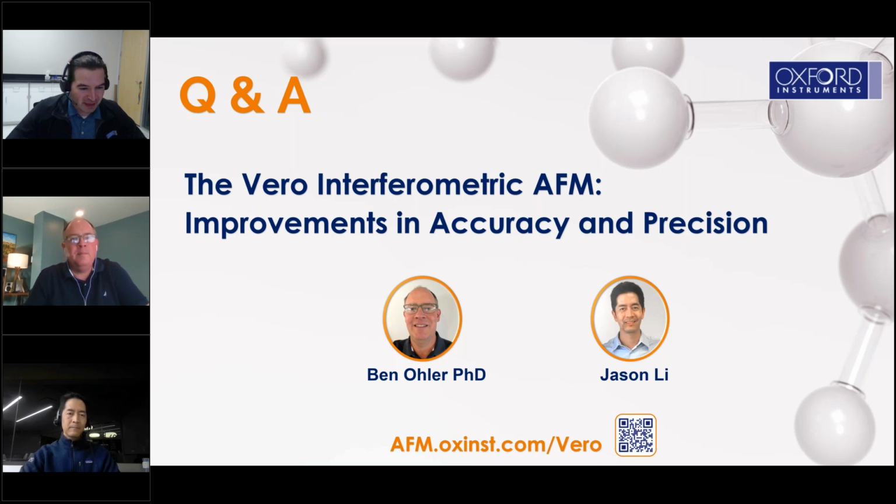Great, thank you. So I just got a new question in here. This can go to most likely Ben, and I'll split it up. It looks like it's a two-parter. So is Vero compatible with in situ high temperature measurements? If so, how high of a temperature?